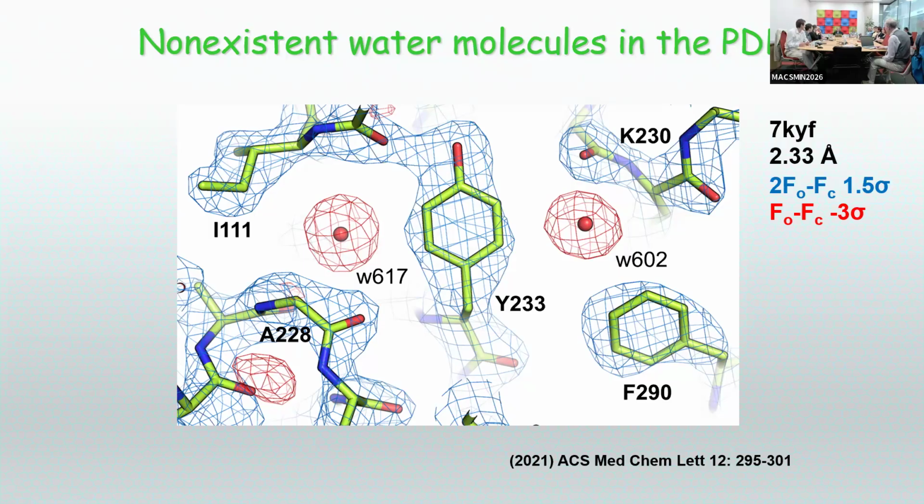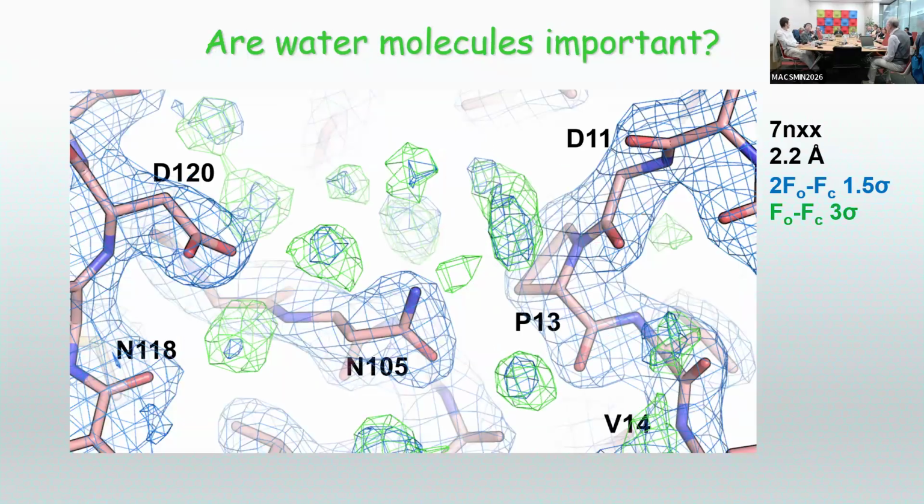What is very strange, when you look inside the PDB file, or the mmCIF, is that for the water, the B factor is supposed to be of good quality. Okay, if you fake it, you can always fake B factors. But here it is the same B factor value for every molecule, like copy paste. And here you can see another case with some very nice densities for waters that for some reason the authors decided not to model. I don't know why.